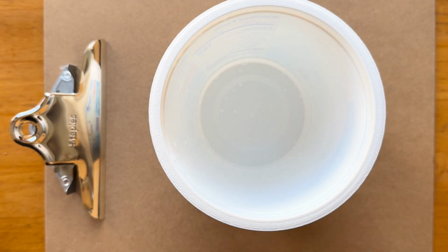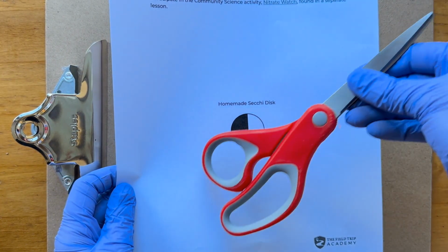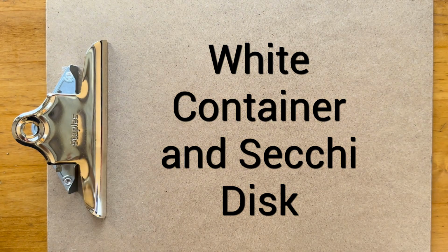However, if you don't have this particular kit, you can also use equivalent, pretty much, a yogurt container with a white bottom. And then I have created a homemade Secchi disc that you can cut out, that you can also use and put on the bottom of your yogurt container.